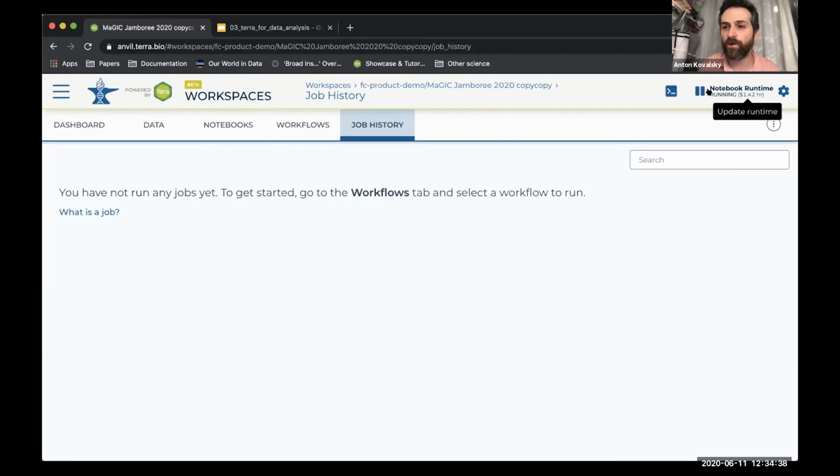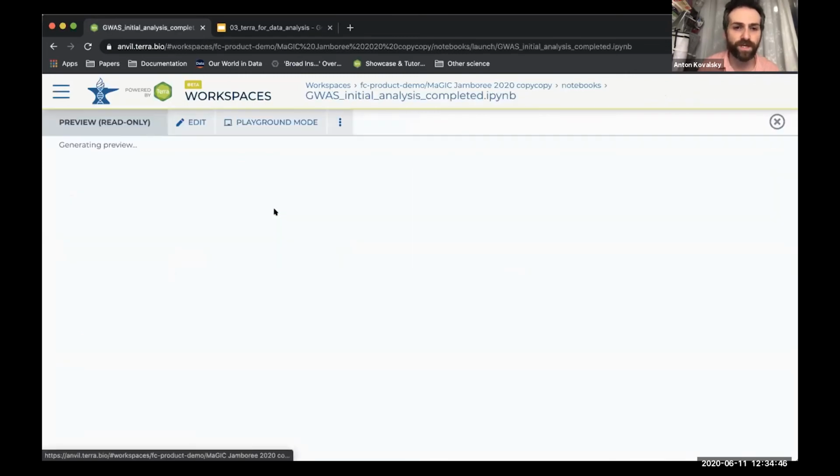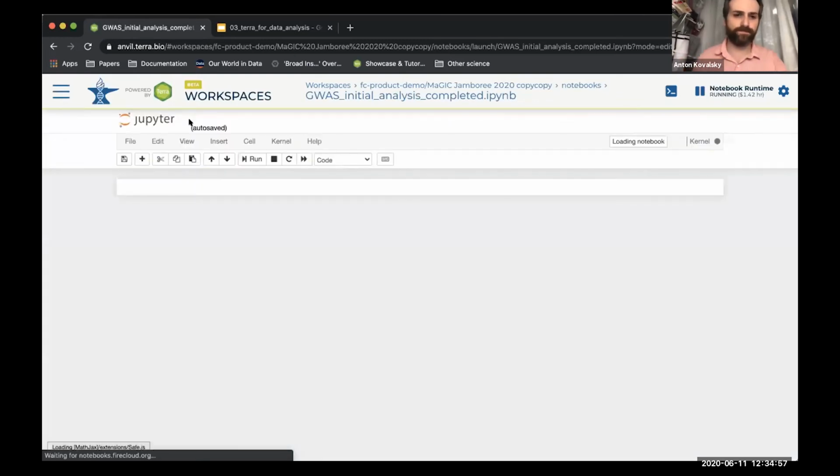I can see that my notebook runtime has started running, so I can come back to my notebooks tab and open whichever one of these I feel like. I'll go ahead and open it in edit mode.